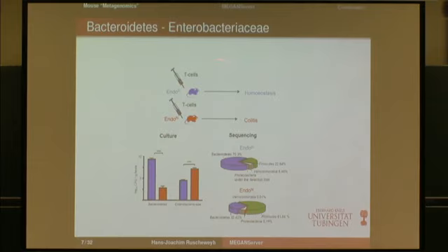This is the same mice as before, and there is a method called culture, where you look at how much Bacteroidetes and how much Enterobacteriaceae is in the feces.